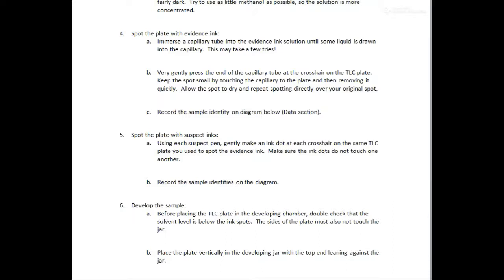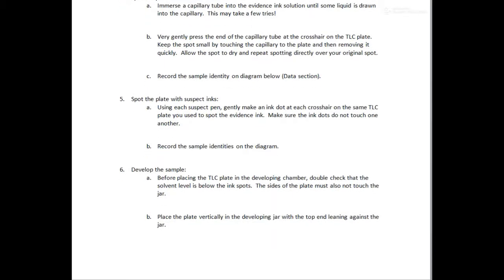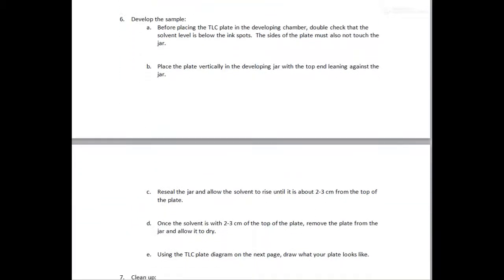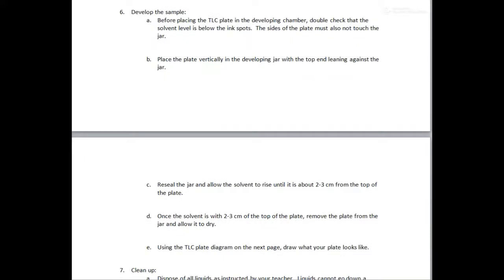After that, you take the glass plate and do not touch the jar or anything. Then after the mobile phase has moved across, you take the TLC plate outside, remove the plate and allow it to dry.